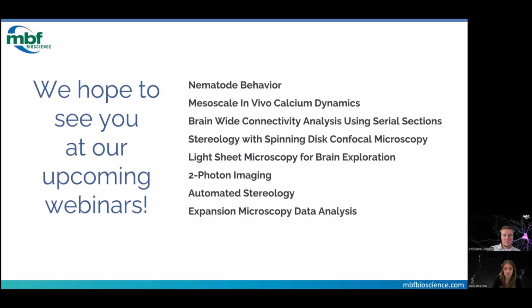One question was, how does this work with indicators that aren't GCaMP? So like GRAB-DA or GRAB-norepinephrine. Are there things that you'd have to tweak? I know the isosbestic signals can be a little different for those.